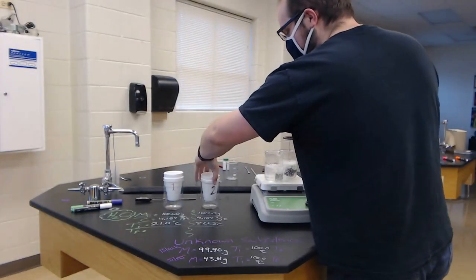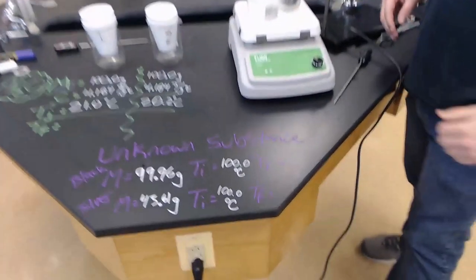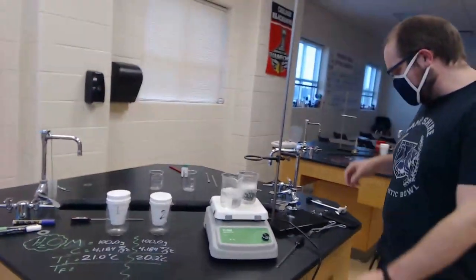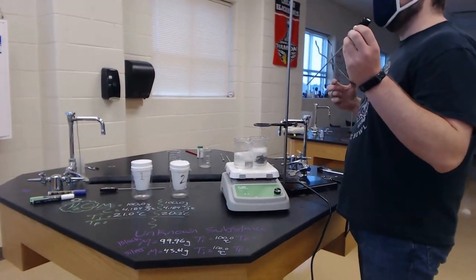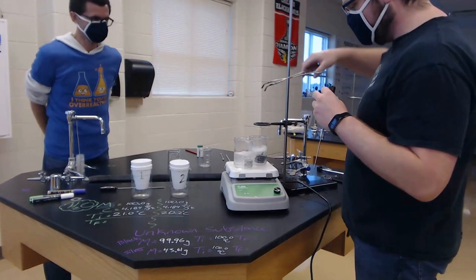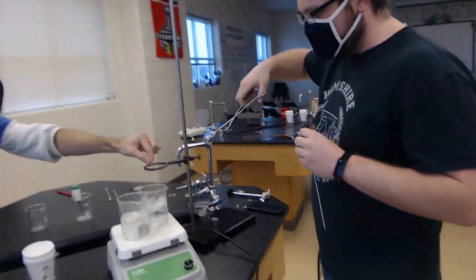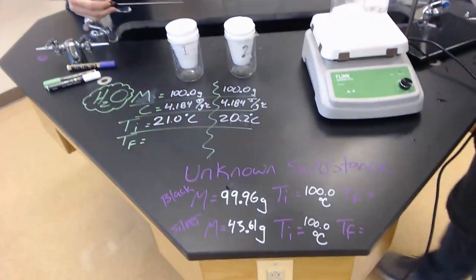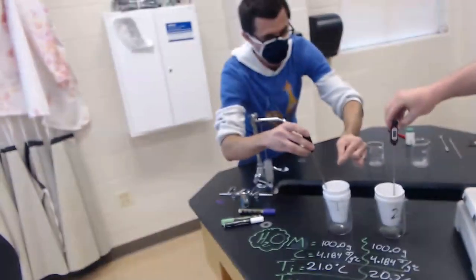We're gonna place them in some calorimeters to see how much heat they release into the water. Each calorimeter has a certain amount of water and we're gonna measure their final temperatures. Mr. C is gonna take our first metal and place it in cup number one — this is our black mystery metal — and I'm grabbing our silver metal. Both metals are being placed into the water.